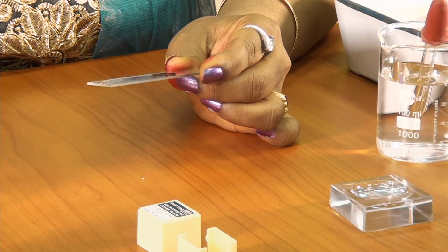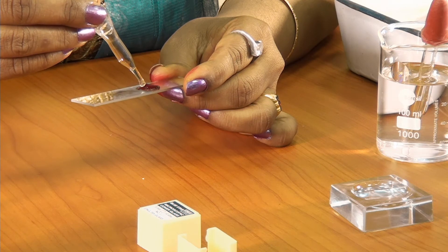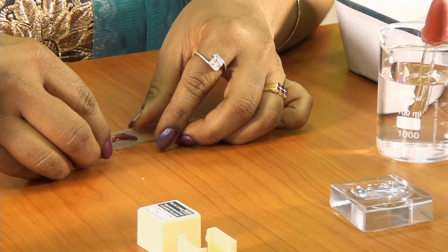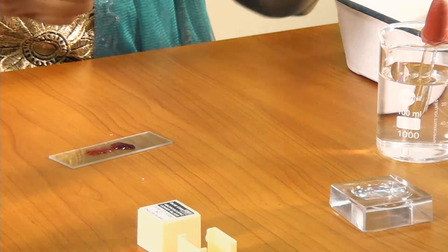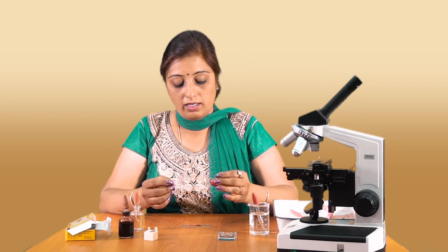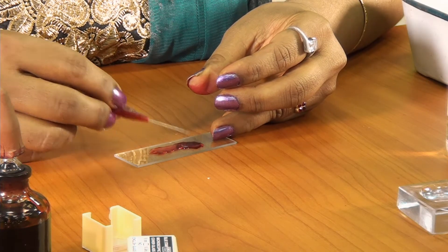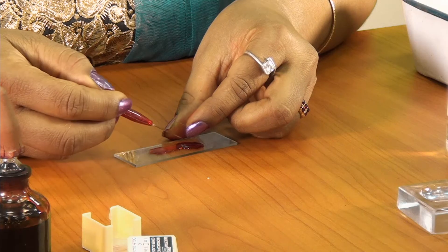To this stained peel, I am going to put a few drops of glycerin. With the help of a needle, this is the cover slip. I need to hold this cover slip at a forty-five degree angle with the help of a needle.